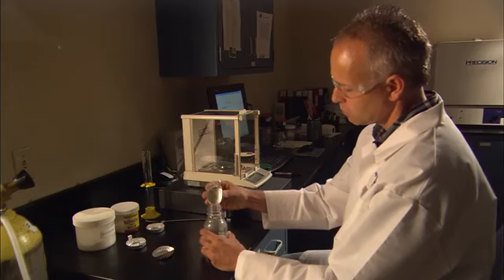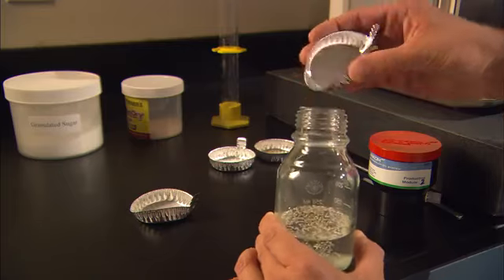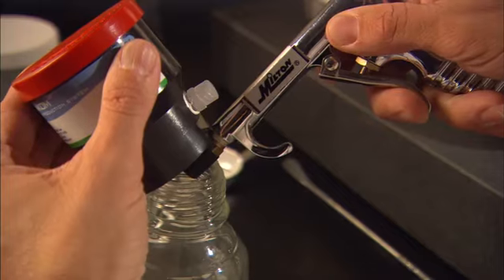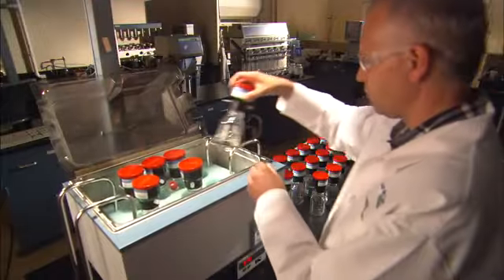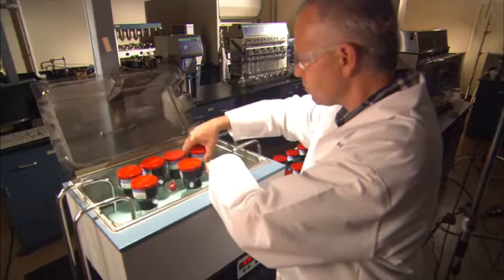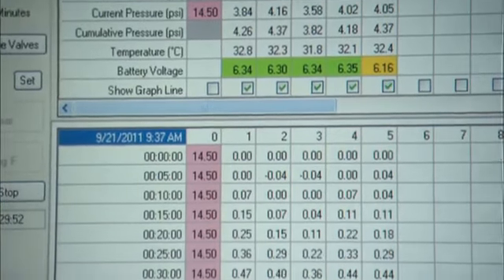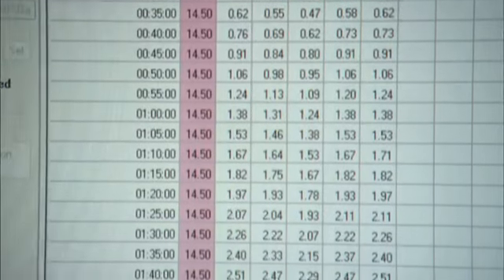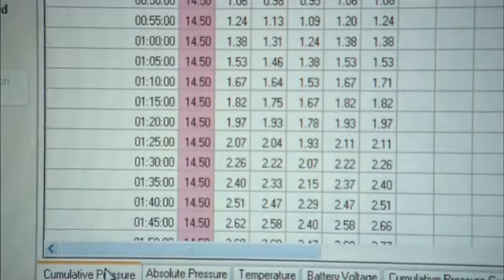Here's how the system works. Microbes, substrate, and buffer solutions are placed in the RF1 modules according to the requirements of the study involved. The modules are placed in an incubation source as needed. As gases evolve, the RF1 module measures the pressure and sends this information together with the temperature of the RF1 environment to the host computer using radio frequency technology.